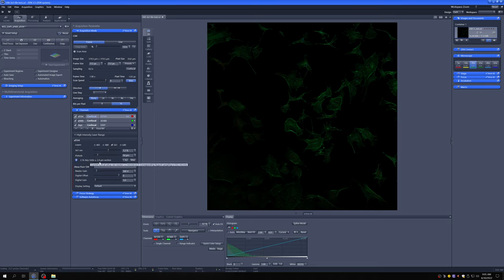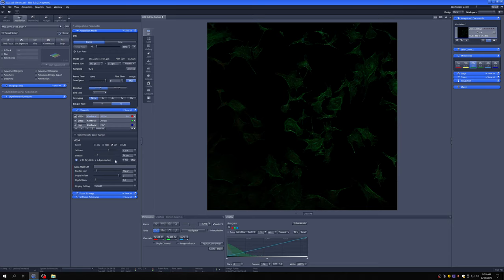And then finally, you can see here, this is the equivalent thickness of the optical section with the pinhole set to this size, meaning we did not cut this sample. I just got it in the mail from a company. But if we had wanted to get an image of this kind on a wide field microscope, this is how thin we would have to cut it. That's sort of the explanation for what this means.